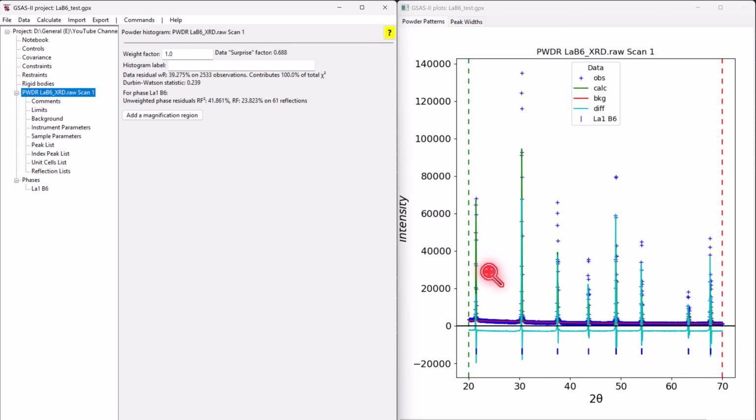The essential sequence is to define a reliable angular range, model the background, select clean peaks, refine intensities and positions in stages, diagnose individual widths, replace those widths with a smooth global profile, save the instrument-only terms, and finally test the file in a fresh project.